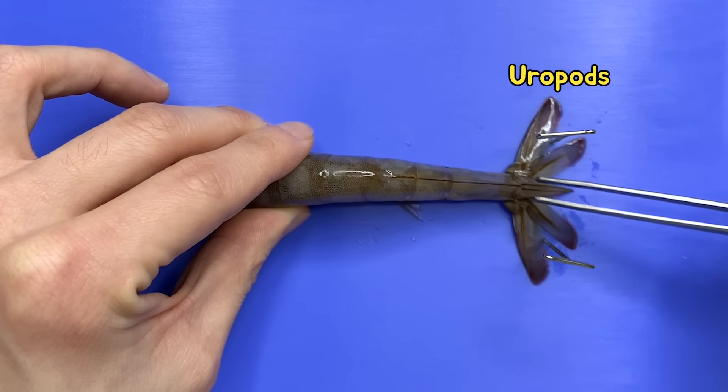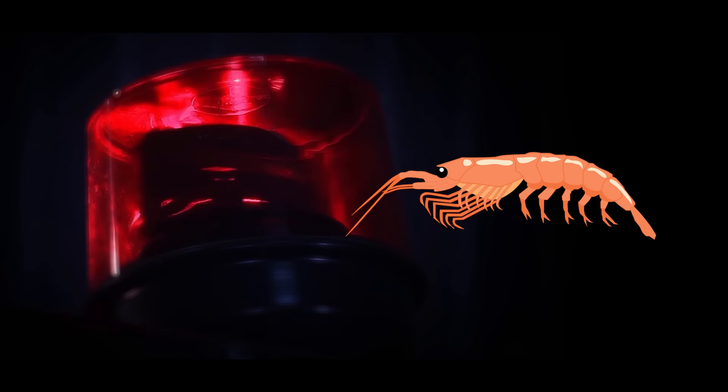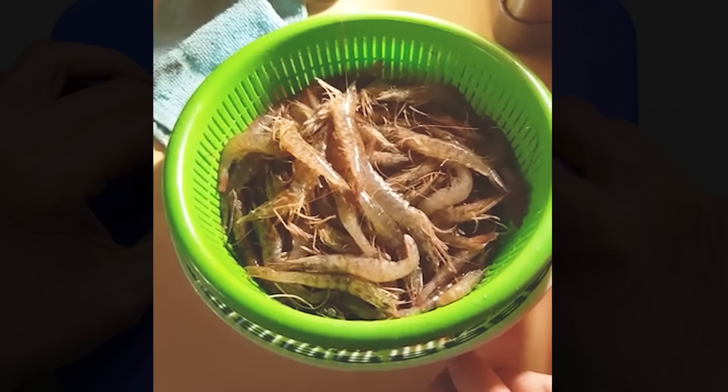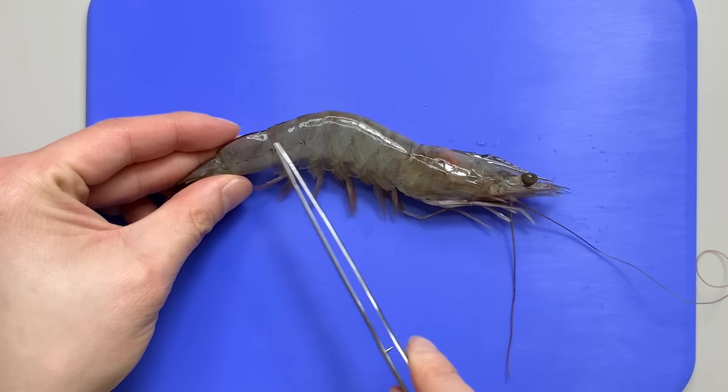How many legs does a shrimp have? Shrimps are classified as decapods with 10 legs. But if you flip the shrimp over and observe it, it has more than 10 legs. Shrimps have a lot of appendages all over their bodies. Let's have a look at the appendages.